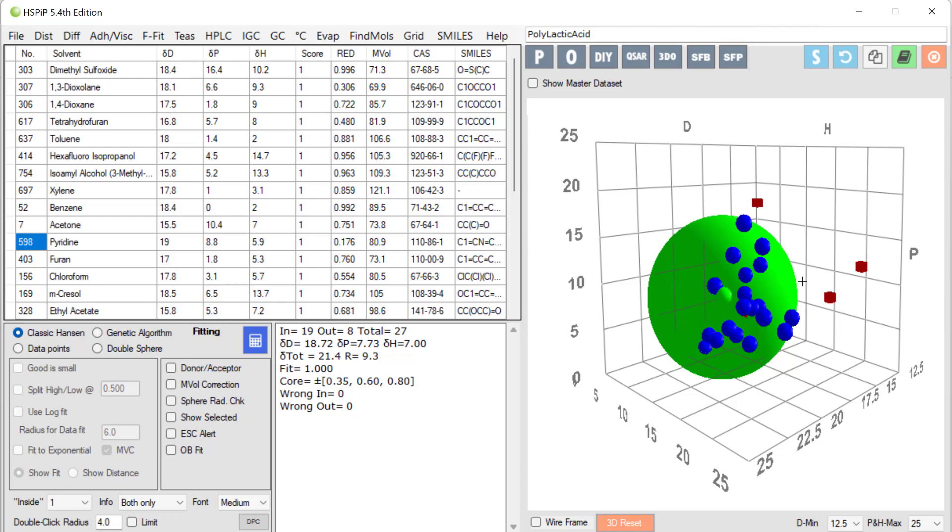What about the radius? Well, these solvents on the edge are probably marginally soluble. So if you had a higher crystallinity PLA or you had a higher molecular weight, these might be outside. They might be bad solvents. So the radius would be smaller.